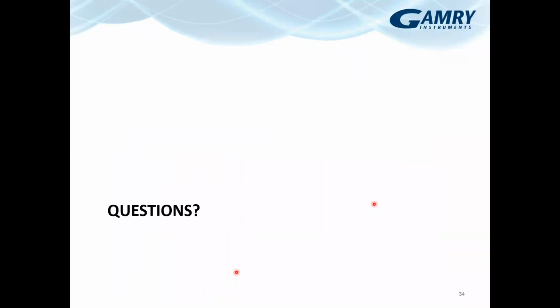Okay, thank you, Jerome. We have some questions that we can ask now, and I think we might even be able to have people raise their hands and ask questions, and we'll unmute them so that they can ask you too. But I'm going to start with an easy one, since we just finished up the biofilm itself. Is EQCM an appropriate tool to monitor biofilm activity on surfaces outside of the laboratory and within industrial water systems?